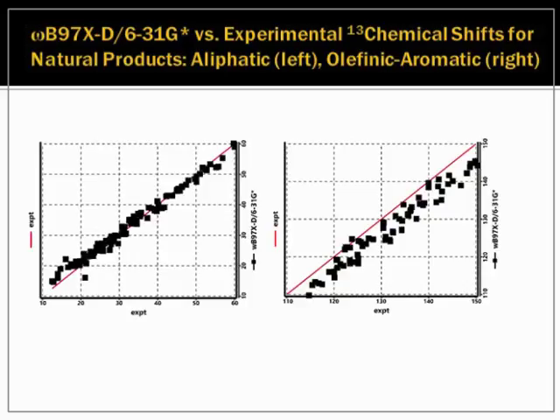It's not perfect. You're seeing errors of a few ppm, but there's probably not a systematic error. In the olefinic region, aromatic, olefinic, it's mainly olefinic. I've tried to not use very many aromatics. There's clearly a systematic error. You're clearly shifting down by several ppm. But you also have a random error, just like you had here. Okay, so we're seeing that in graphical form.